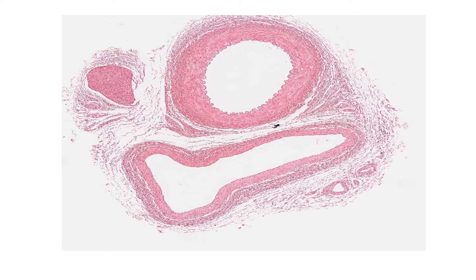What you're looking at now is a cross-section of an artery and a vein on a slide. Do you think you can tell which one is the artery and which one is the vein? Think about the function of both vessels. Which one would you expect to have a thicker wall?